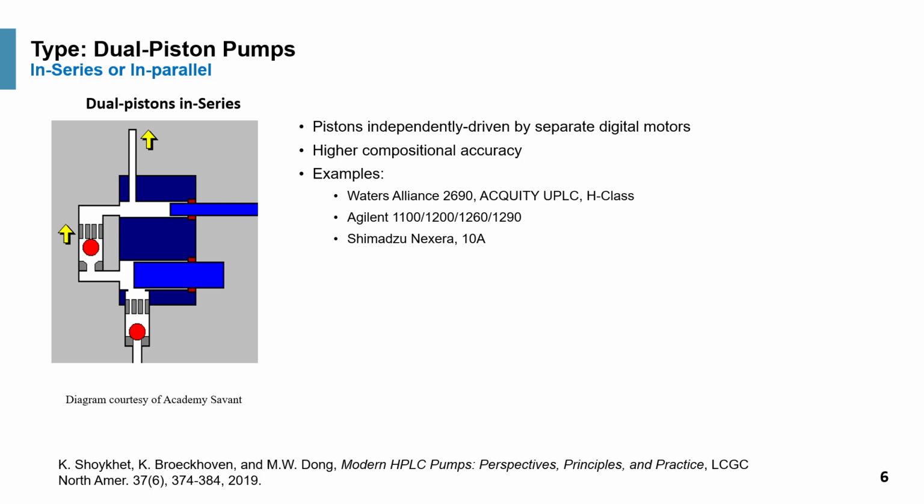Now, most modern pumps are in this category called dual piston in series. There's also dual piston in parallel, which is less common. Let's focus on dual piston in series. Pistons are driven independently by two separate digital motors and two pistons.